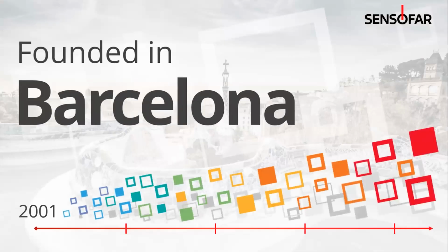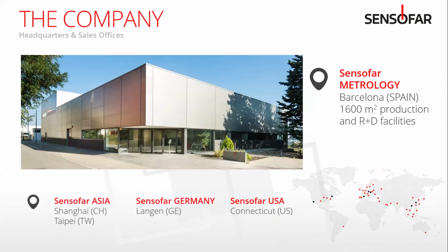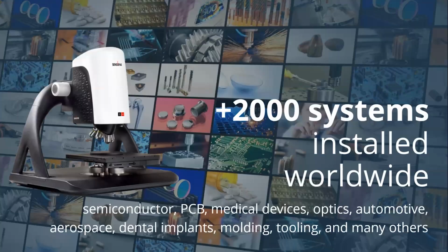So who are we? We are a spin-off from the Technical University in Barcelona. We were founded in 2001. Our headquarters is in Barcelona, but we have locations in Asia, Germany, and our HQ in the US is in Connecticut, but we've got distributors all over the country. At this point, we've installed about 2,000 systems and climbing worldwide in industries ranging from semiconductor stuff to dental implants to archaeology, tooling, and tons of other stuff.